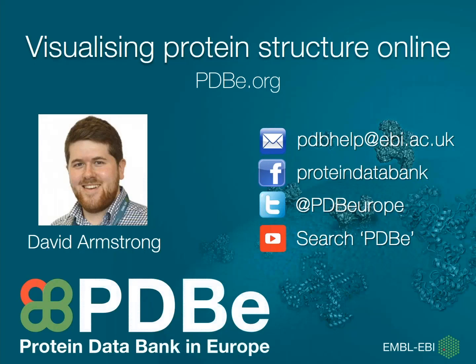So hello everyone and welcome to this EBI webinar. This PDBe webinar will give you an introduction to macromolecular structure visualization at the PDBe, and this is using the new LiteMol viewer at our website.